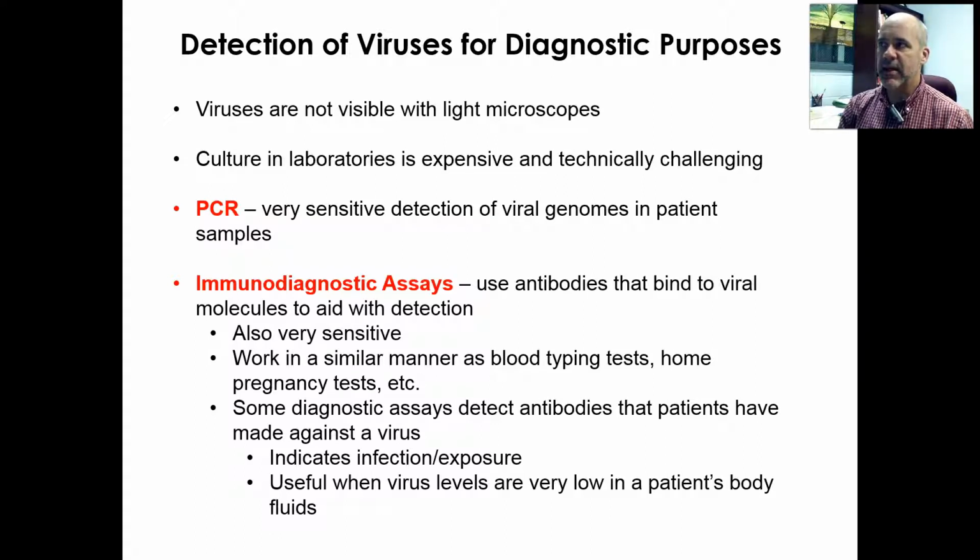All right, so now more typically, when viruses get diagnosed these days in a clinical laboratory type setting, they're not often cultured. Instead, we're using other techniques. If you remember the polymerase chain reaction, PCR technique, that we talked a little bit about back in chapter 8, that is a very specific DNA-based technique that can, in a little tiny test tube, amplify very specific sections of DNA.